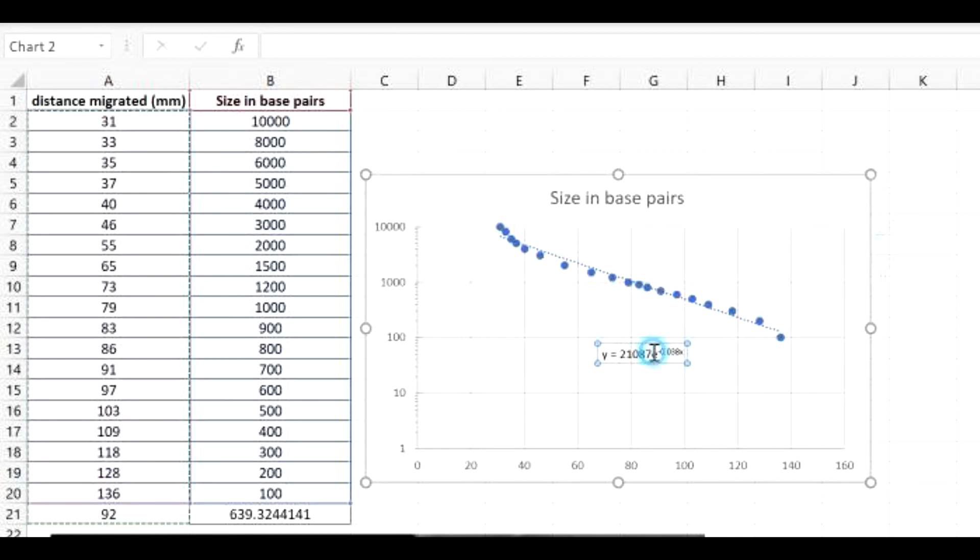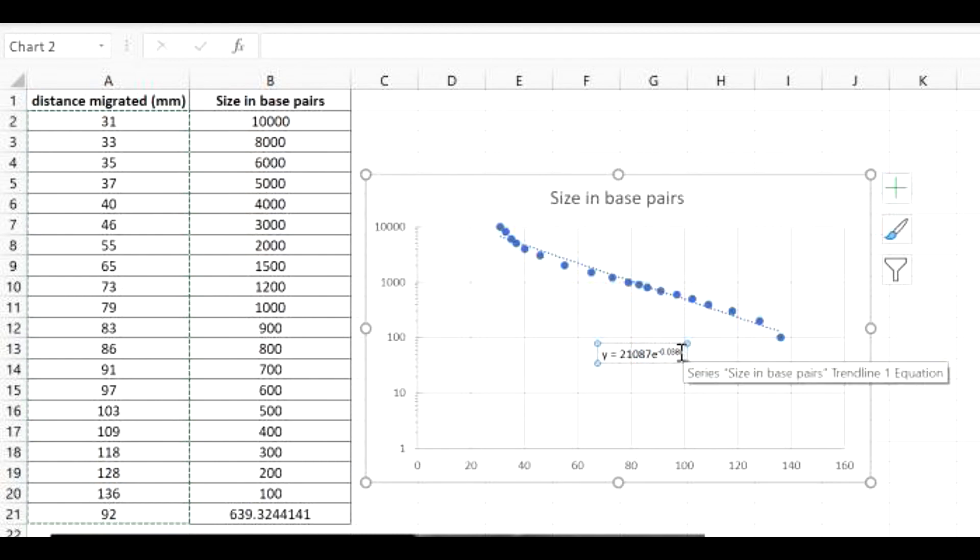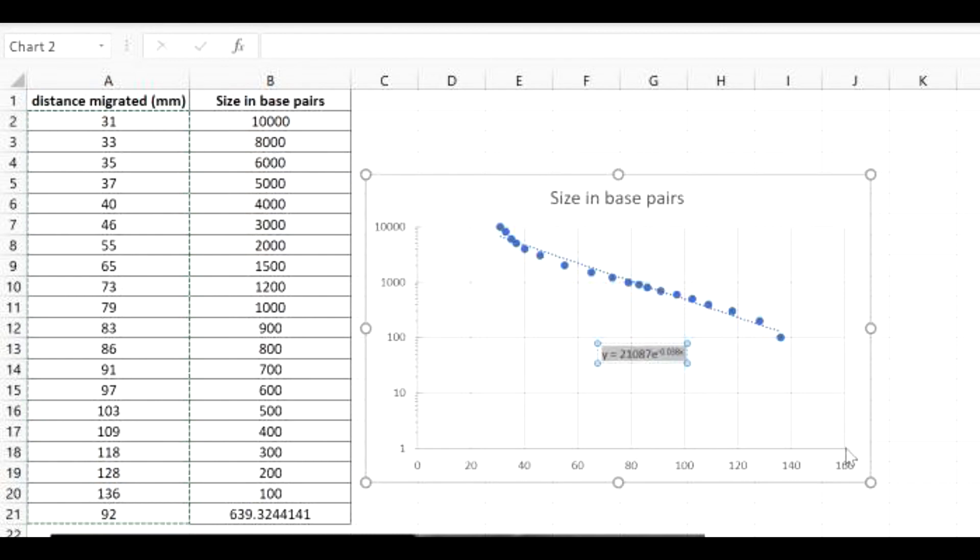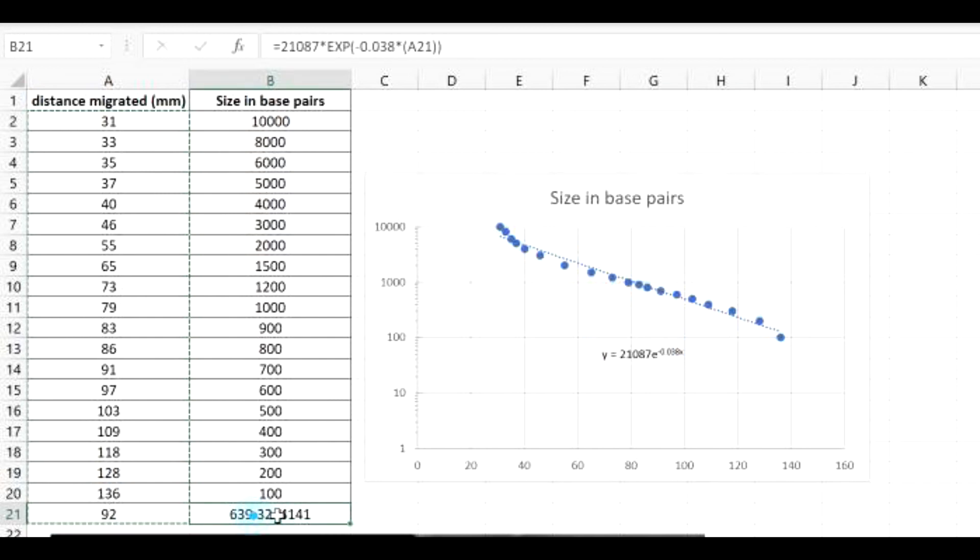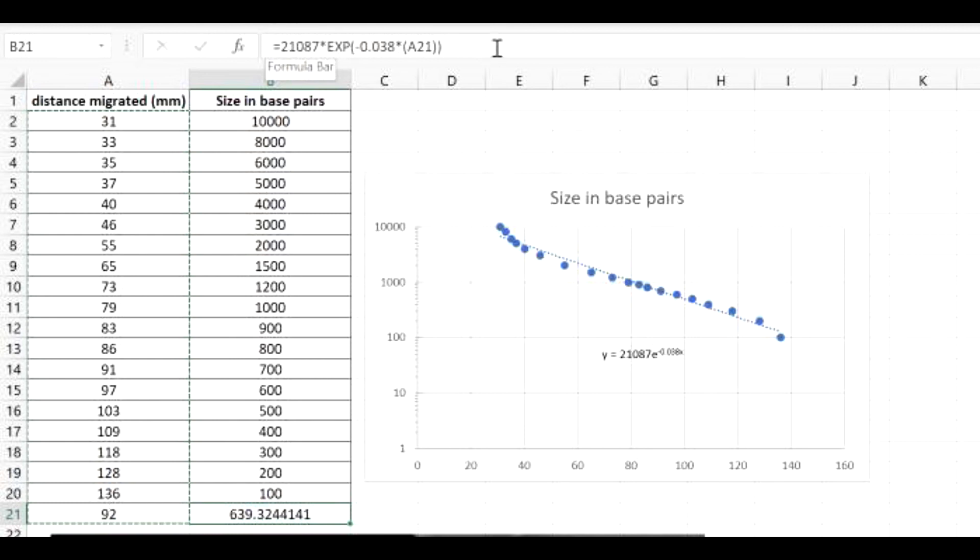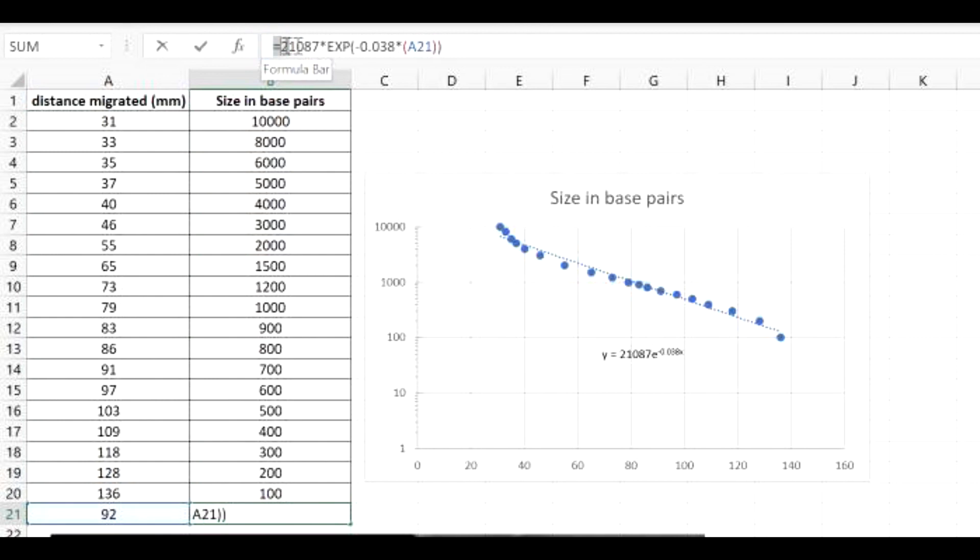Now if you look at the equation that it shows, this is the equation you're going to use to calculate any other distance to get the base pair size. So I already did that in this Excel file here in this equation. Excel has the ability to solve formulas for you. So if you want to know how to do that, you just type equals 21,087 times EXP, and then you have to put in this equation here.